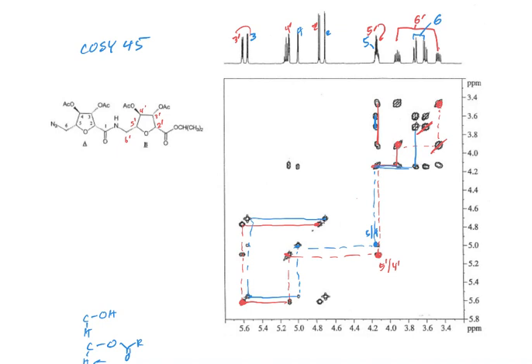So that makes it good. This is a case where you might run this spectrum and, in my luck, probably, all of these peaks or something here would all be right on top of each other. But then that's where you could maybe try a different solvent and maybe they're going to move apart better. So you could play around with that.